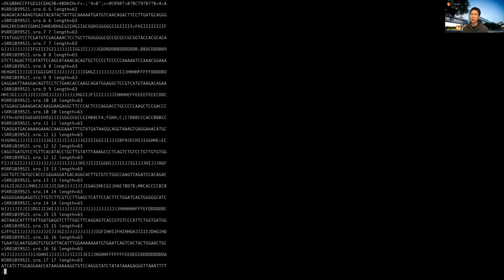For most Illumina sequencing, the reads are not too long, like 100 bases. So the quality is typically high. I mean, the entire sequence, the quality should be satisfactory. But there is software to filter.